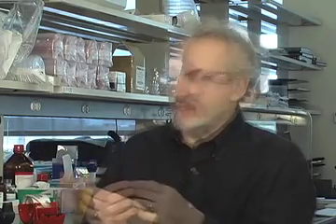We also think that we could integrate different types of organs together. So for example, a heart and a lung, or a bone marrow and a cancer. The idea is to link these together. You could see immune response, you could see multi-organ functionality, and I think that's really going to be a whole new path for drug development in the future.